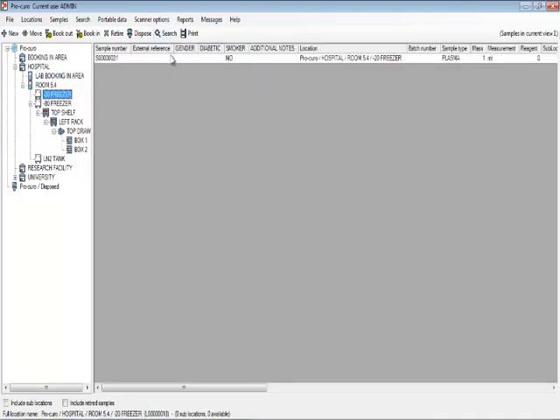This is the end of this tutorial, and the next tutorial will be on moving, booking in and out, and retiring and disposing of samples.